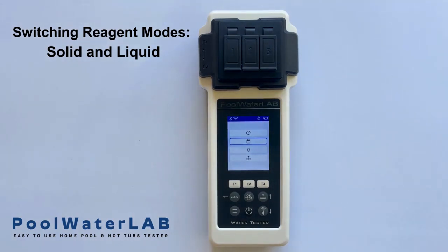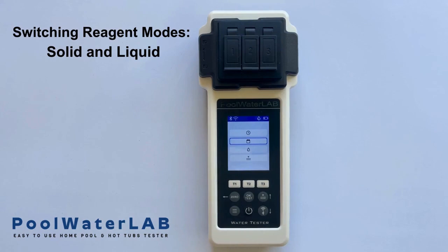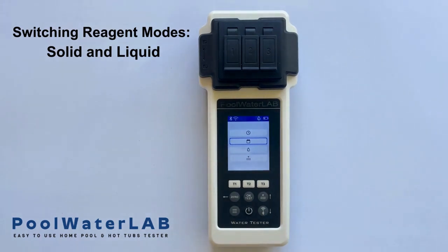Ensure that you use the appropriate liquid chemicals for accurate results. It's important to note that if the tester is set to liquid mode and you add solid reagents, it will not display accurate results. Therefore, always ensure that the tester is in the correct mode for the type of reagents you are using.